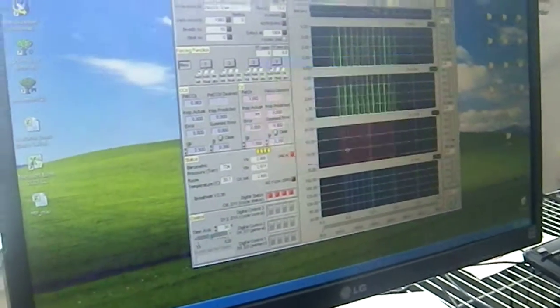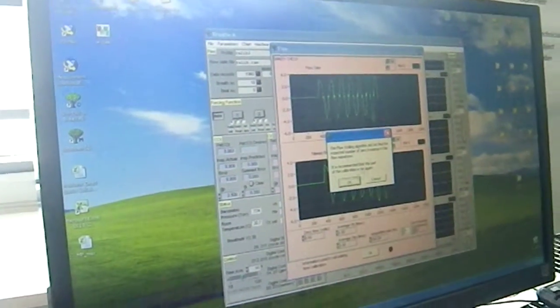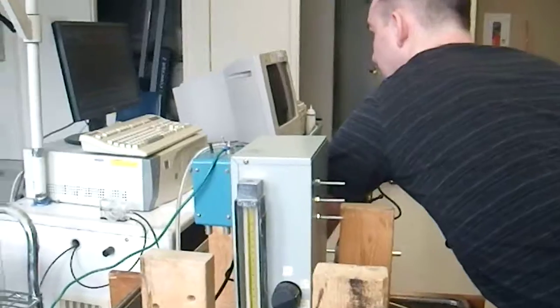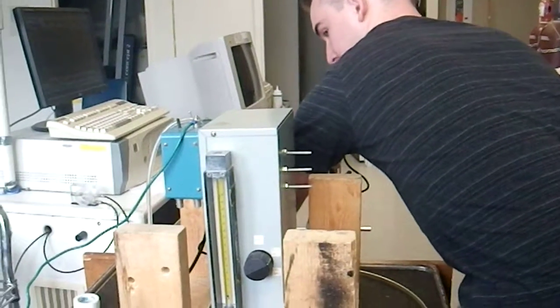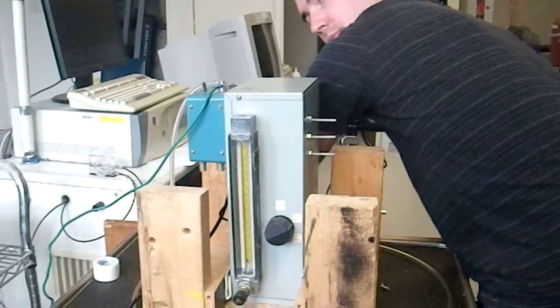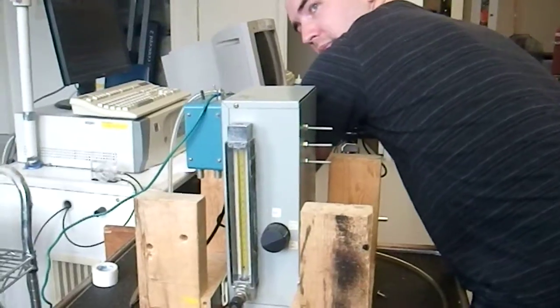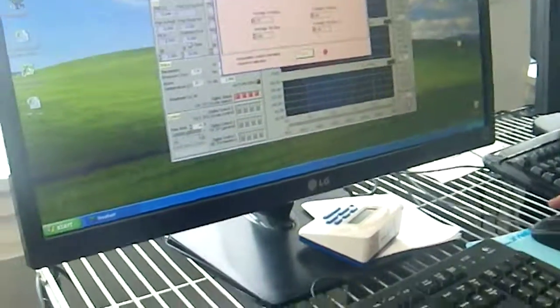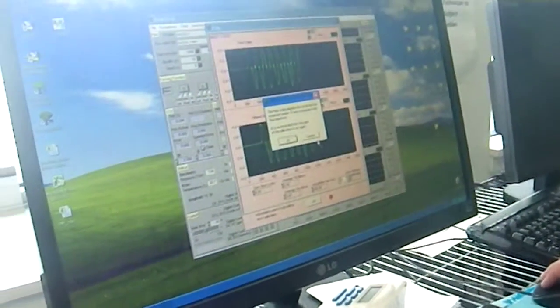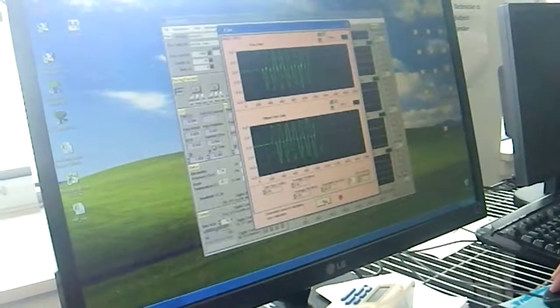It always is the first time, so we hit OK. It'll ask you to do it again. So hit OK, and then OK down here, and then redo it. So now you see that red is bright, it's on, so it's good. It's going to keep asking you to redo it. When that light's on, you can hit cancel, and then OK down here.